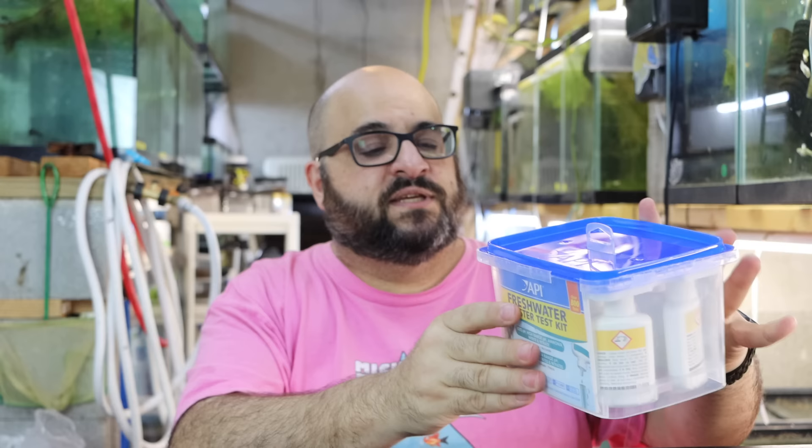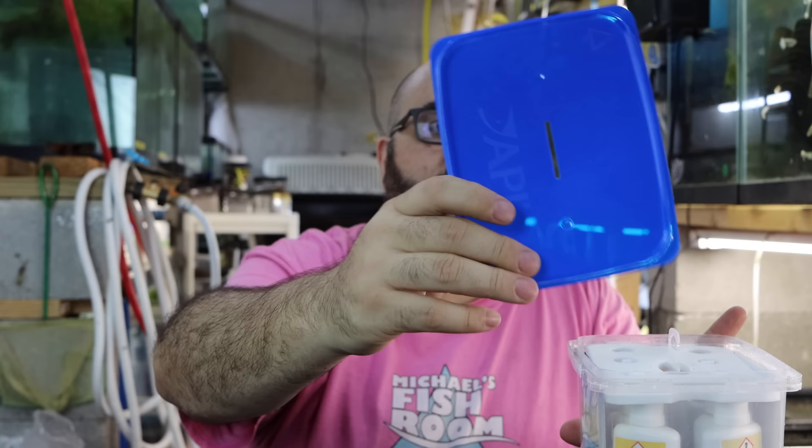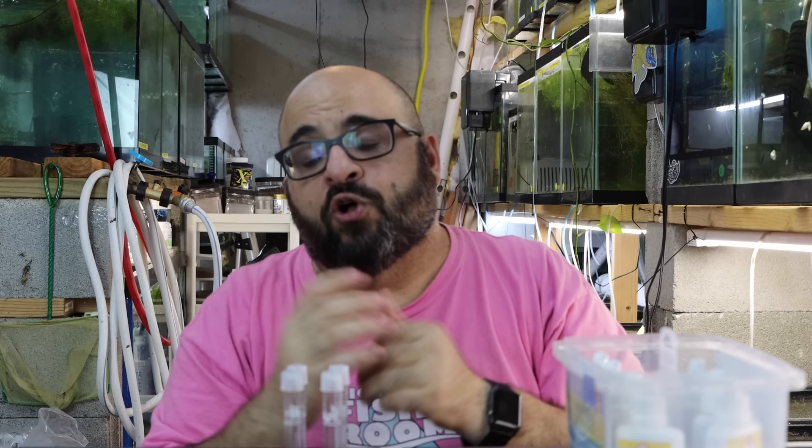This is a brand new test kit — I just opened it before we started filming because I actually made some bloopers with it by accident, which you may see at the end. Opening it up, it has a foam insert. Inside we have test tubes — these are pretty fragile and break quite easily. You can buy replacements; sometimes your local fish store has them, or you can find them on Amazon.